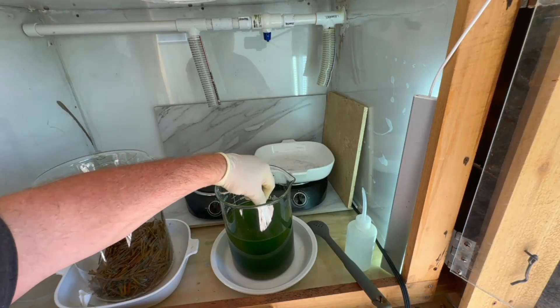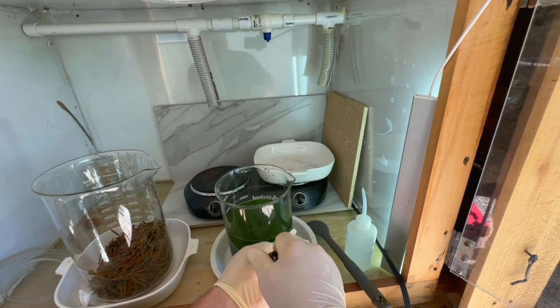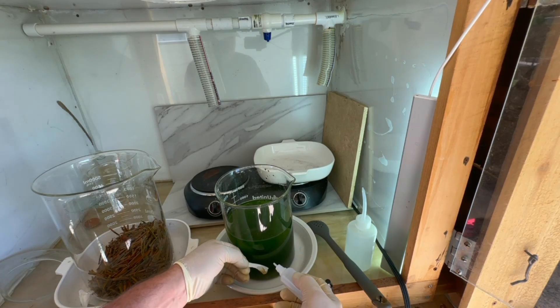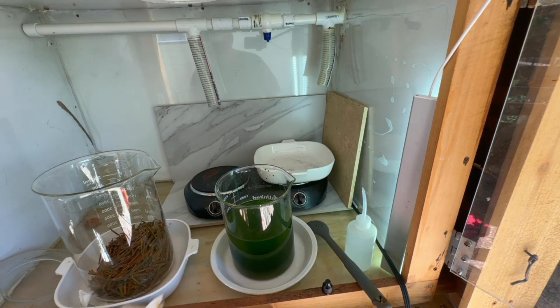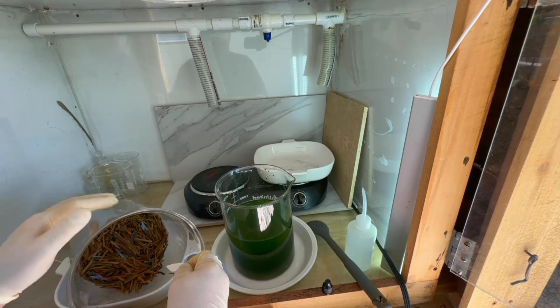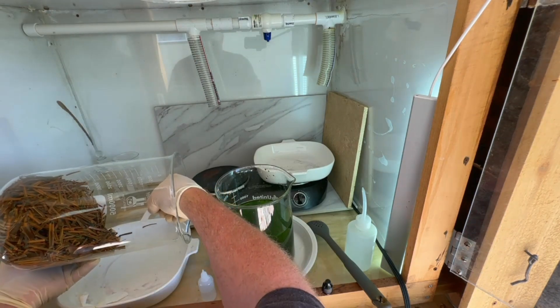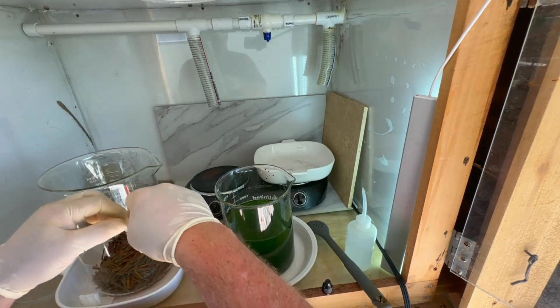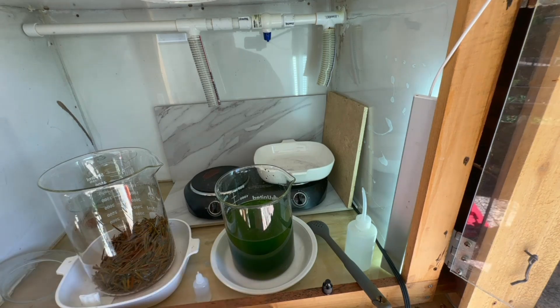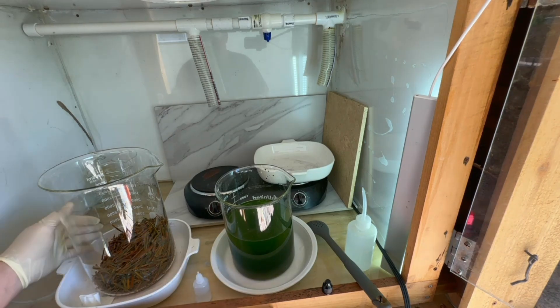We'll do a couple of stannous chloride tests. First we'll test our beaker of solution — and we see it turn purple, positive for gold, which is what we're looking for. Then I'll do a stannous test on the little bit of solution left in the beaker with the fingers, to make sure we don't have any significant amounts of gold left in there. That comes up negative, so we have all the gold-bearing solution out and we're ready to move on.